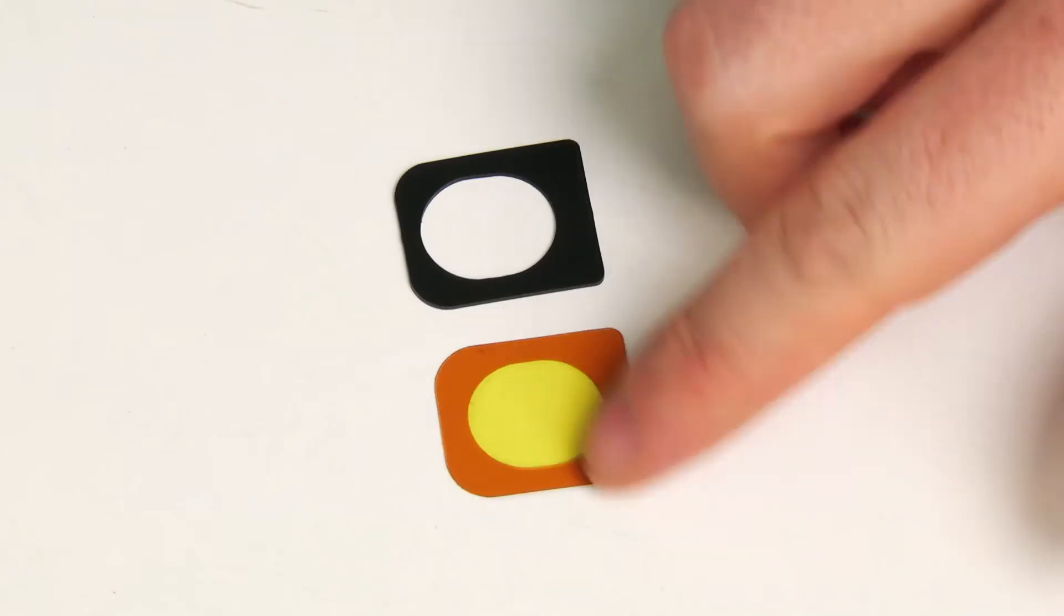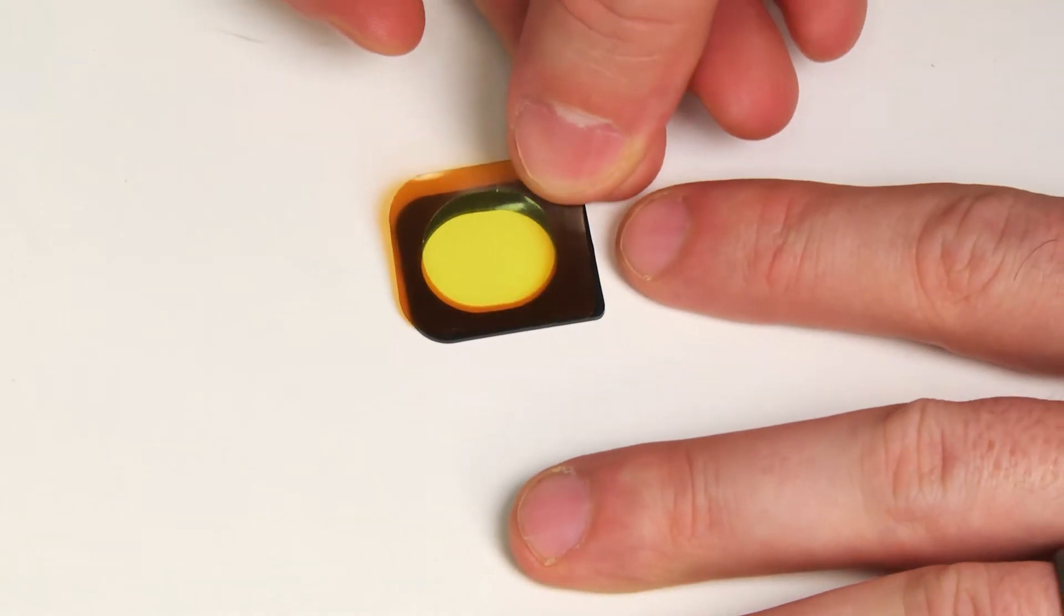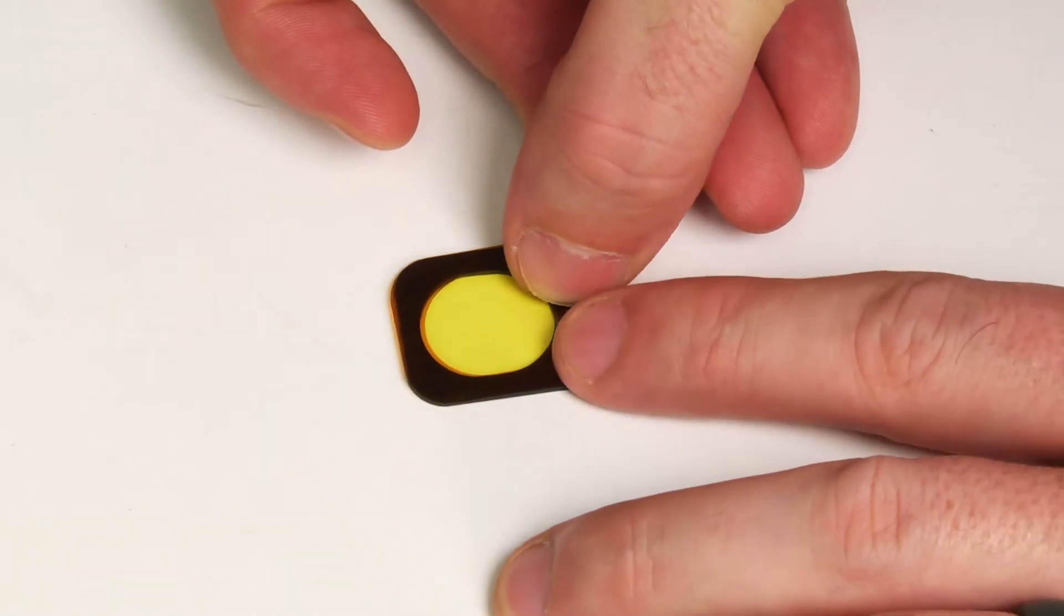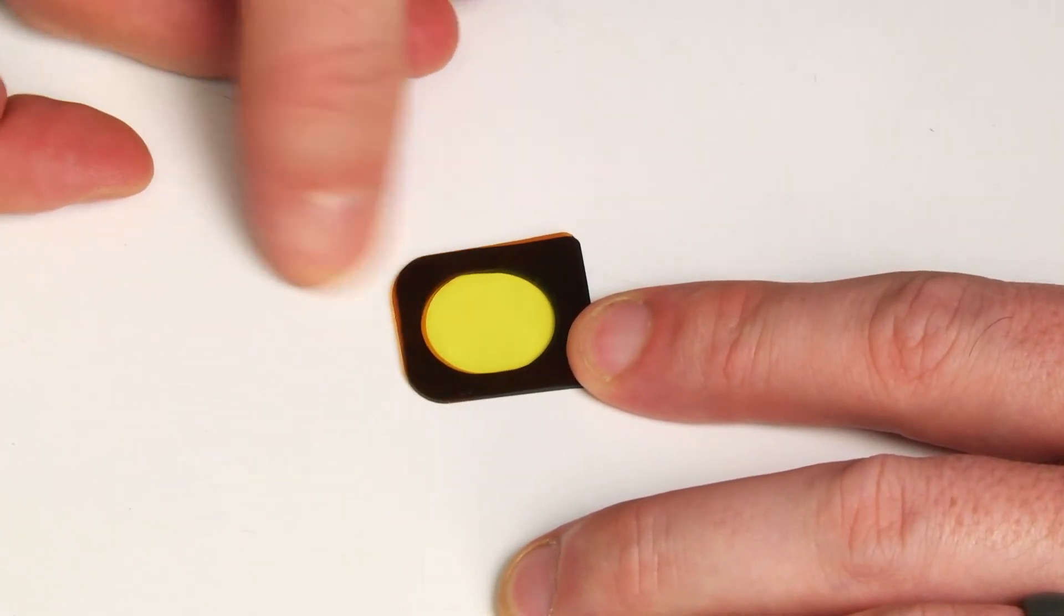Place the analyzer window on the gasket so that the rounded edges match up. Gently press around the edges of the window to adhere the window to the gasket.